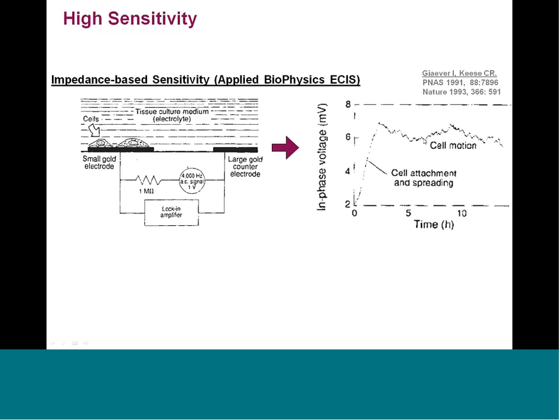So they characterized this and found that, in fact, that ruggedness was eliminated by depleting ATP, so it was energy dependent, or by blocking actin polymerization. So this was a specific cellular phenomenon, which they termed cellular micromotion. And as such, it became not a problem, but a tool.